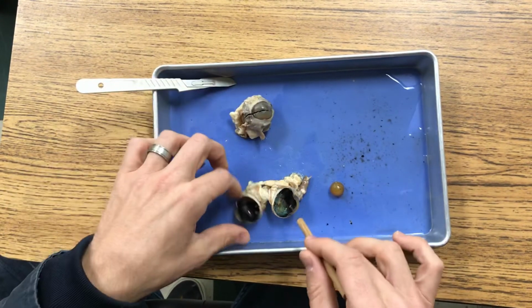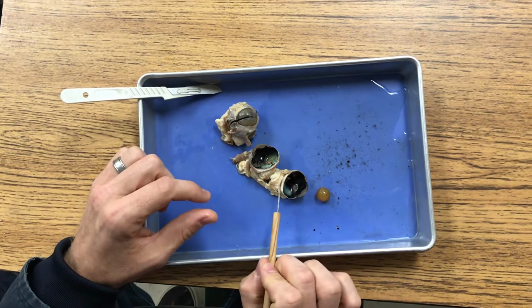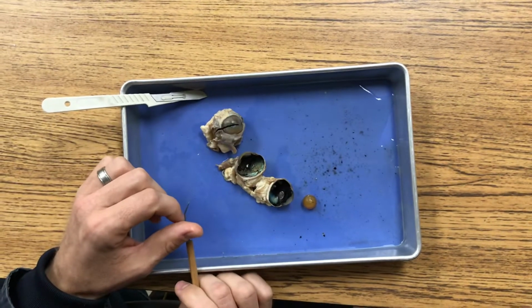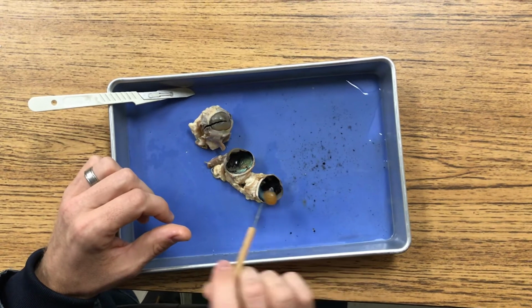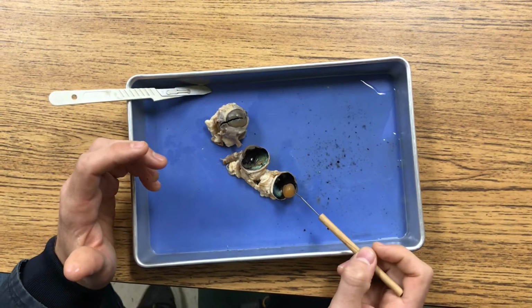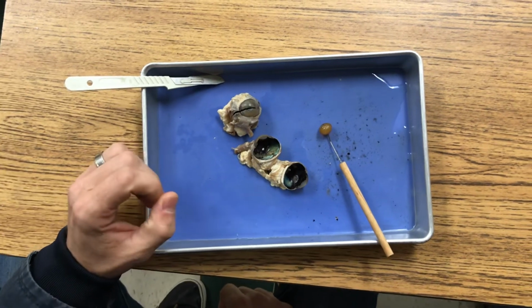Okay, and then, so let's see, other structures you can see. Coming out of the back of the eye, you have the optic nerve. And I think that's it. This is the lens. Those are all the structures you can see. So you can see a few more structures on the model. And those are all the ones you can see on the sheep eye.